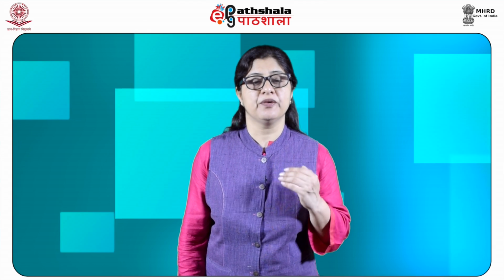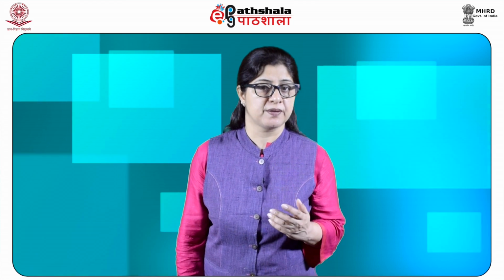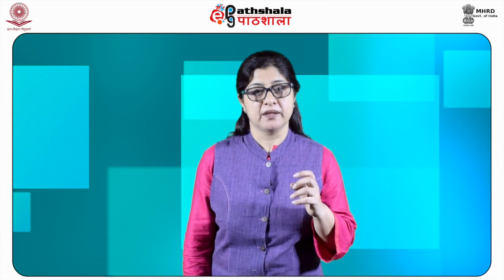The apparatus used in the column method consists of a glass column fitted with a glass wool plug or a sintered glass disc at the lower end. An ordinary burette could also be used. The resin to be used should have a small particle size. This provides a larger surface area for contact between the solution and the resin. In general, the diameter of the resin beads should be less than 1/10 of that of the column.